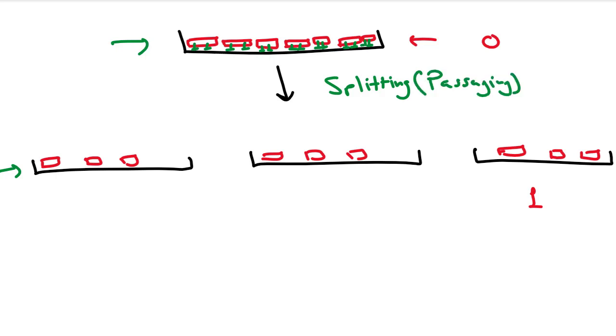So we say that, okay, cells were at passage 0 here, so P0, and that they're at passage 1. So if I were going to split them again, or passage again, then the next one would be passage 2, and etc. By keeping track of the passage number of the cells that you're using, you have an idea of how old your cells are.